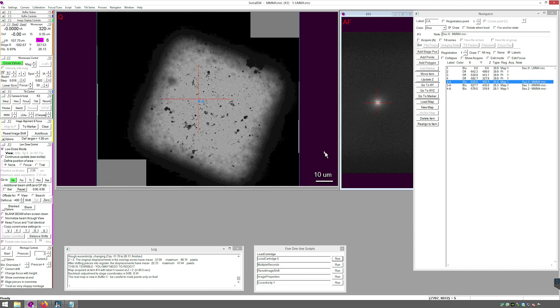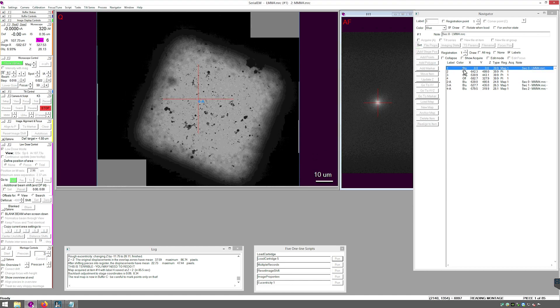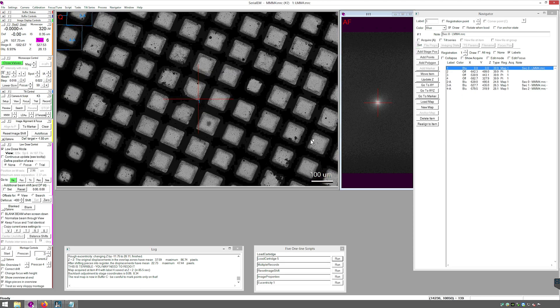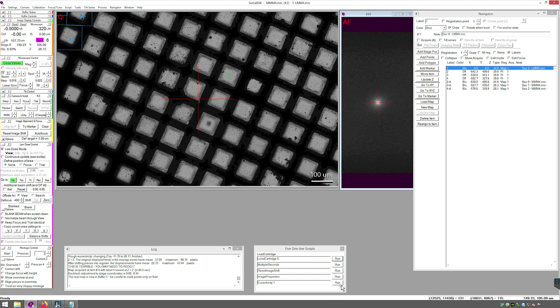You can delete the green polygon to keep things cleaner. Next, we need to set up our multi-shot parameters. To do that, open the LMM and navigate to a Setup Grid Square. Setup Grid Squares are dry grid squares with obvious holes that you would not be collecting on. This one in the center is a great candidate. Once the software has navigated to that position, run Rough Eucentric.